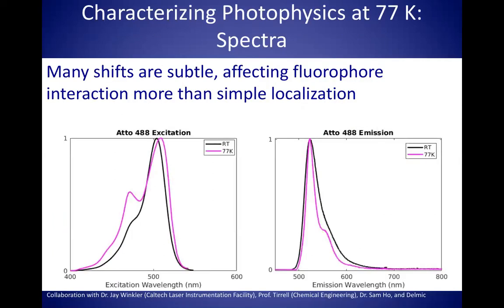So one thing that we're doing is to simply characterize some of these changes. And the idea here is that by releasing these databases, we can help people design their experiments, so choosing fluorophores that either will work together or work independently, and that will be bright. And also, we can help microscope design. So we are assuming right now that fluorophores behave exactly the same way, which means that cryofluorescence microscopes are sold with the same filter sets and illumination wavelengths as they are at room temperature. And so we need to be able to say if this is a good practice or not.